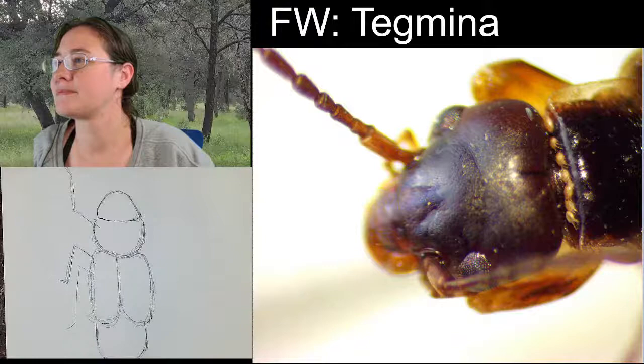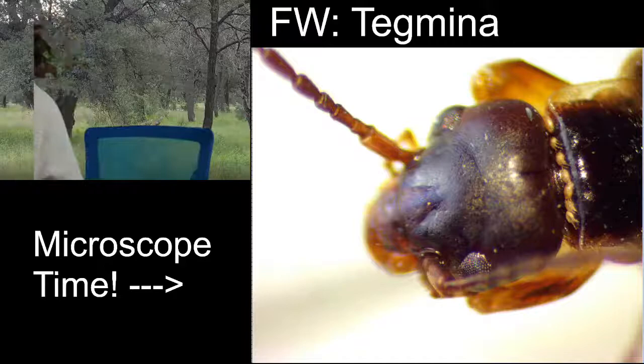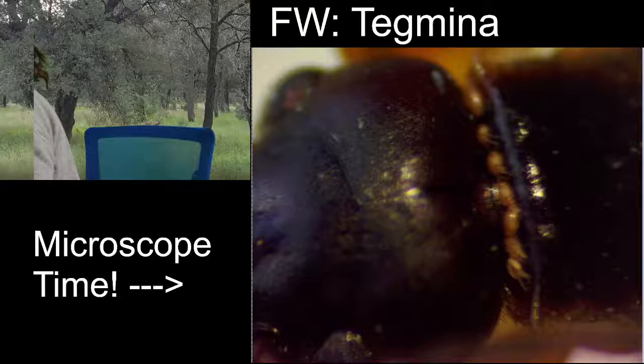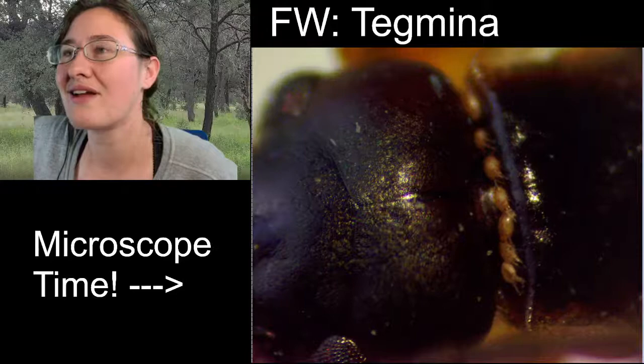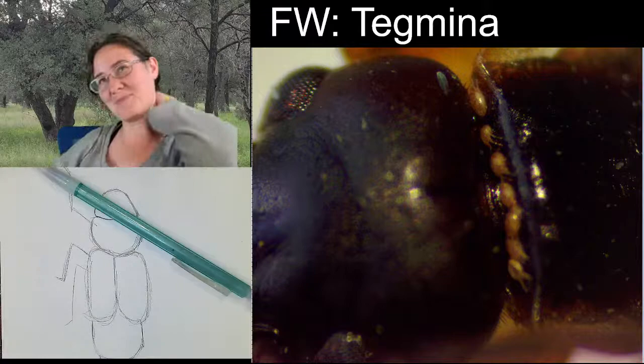She does have a pretty kind of... Oh. Oh my goodness, that's not a necklace. That's not a necklace, and it's not hair. Those have legs. Those are mites. Those are commensalistic mites.